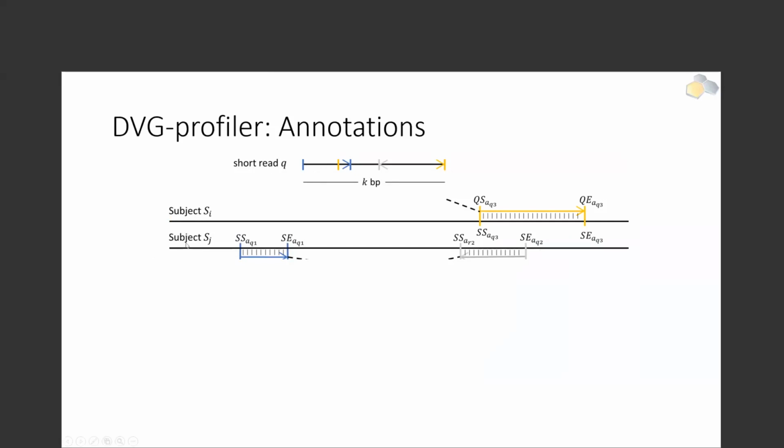It could be one sequence, it can be multiple sequences. It doesn't really matter for the sake of the algorithm, and you will have the sequences aligned into multiple places. In an ideal scenario, you have a read that doesn't capture any junction, and the entire read is aligned somewhere in your subject. That would be perfect, and that is practically a well mapped read.